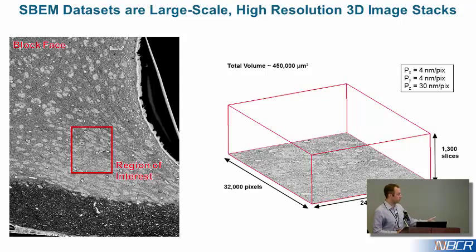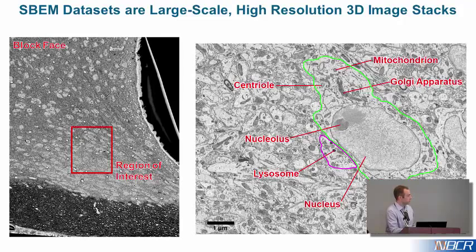And what you'll see here is it's going to zoom in, showing the multi-scale nature here. Of course, in that one plane, we can see about 60 to 80 cell nuclei. Zooming in, we still have the resolution to discern individual organelles. You can see here what I've pointed out: nuclei, nucleoli, mitochondria, lysosomes, even synaptic vesicles. There's synaptic vesicles around, ER, Golgi apparatus. It's all stained and it's all visible and it's all quantifiable.